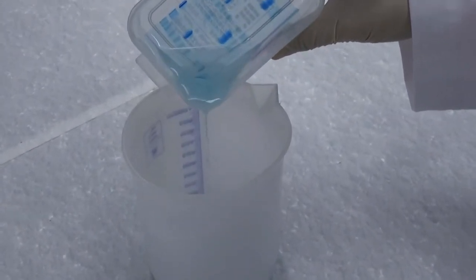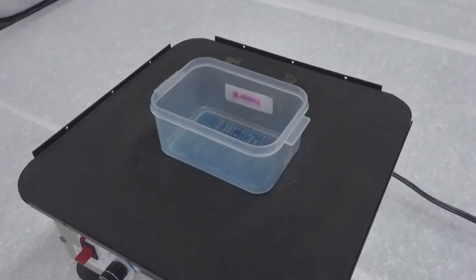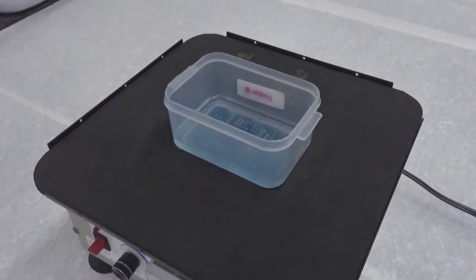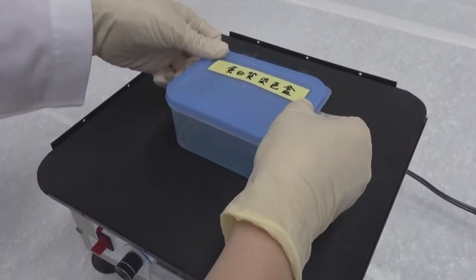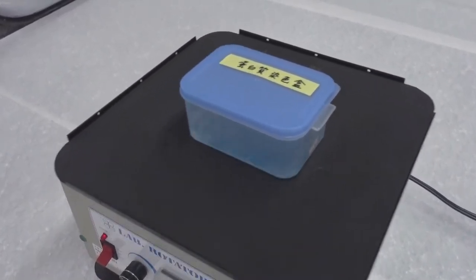Pour the liquid waste into a designated container. You may wash the gel with deionized water a few more times with shaking until the protein bands become distinct against a transparent gel background.